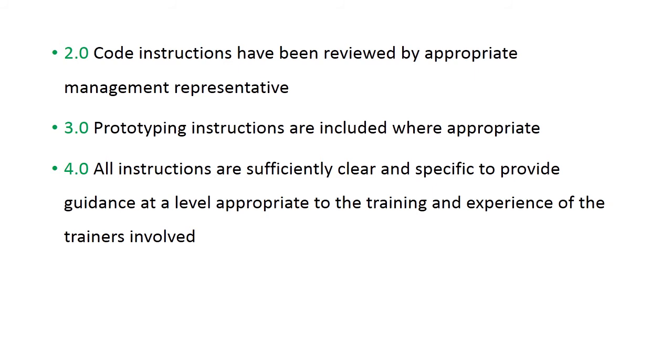Communication should be very clear about the need and the requirement of laboratory management pertaining to the laboratory management information system software. So communication is a very important part. There should not be any ambiguity in the communication between the laboratory management and the coder.